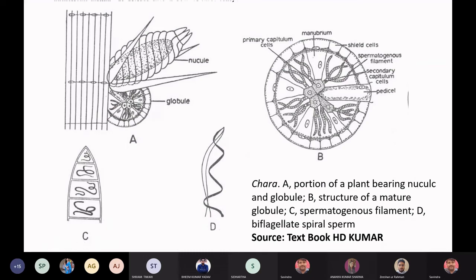आपको आंसर पता लगा कि why we have used two different stains, iodine and acetocarmine? Yes, sir. Why we have used two stains? Because when we want to see the storage material, where we will find the storage material? In the egg cell, क्योंकि उसी को नरिशमेंट देना है, उसी को पाल पोस के बड़ा करना है, germinating zygote को, dormant zygote को.